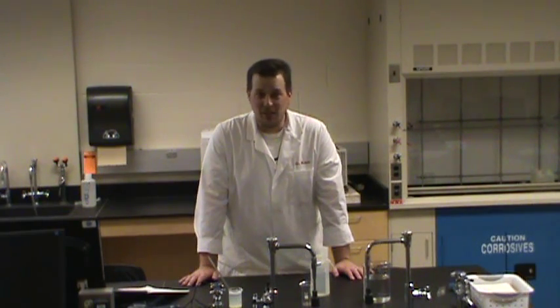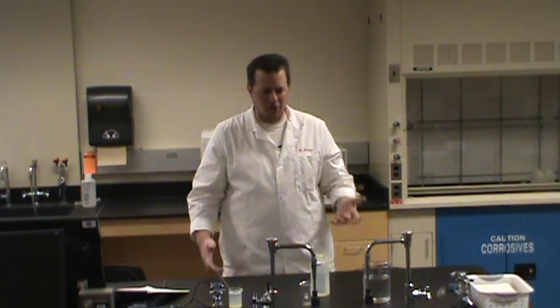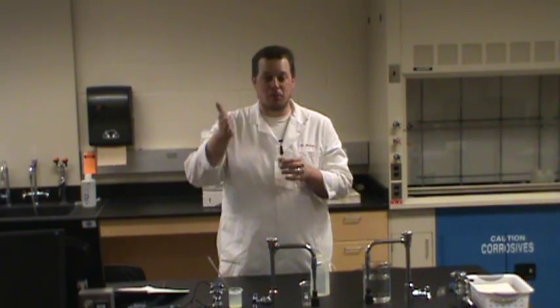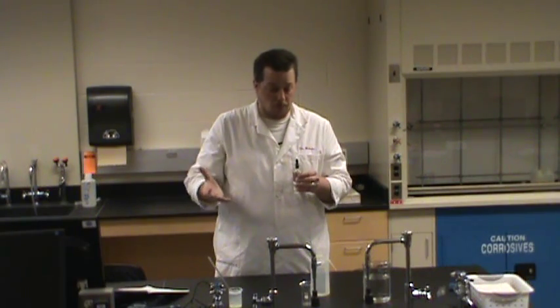The only other technique I want to talk about today in the pre-lab is a technique that, again, many of you will probably think, I don't need to learn about that. I know how to use an eyedropper, but unfortunately a lot of you probably will be tempted to not use an eyedropper correctly. These bottles and all of the dropper bottles you're going to be using have to be kept uncontaminated. If we start mixing the contents of the bottles, everybody ends up getting bad results.